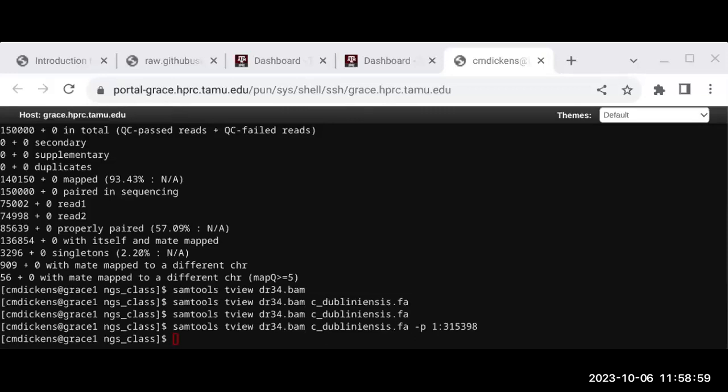If you're going to call this, if you only have a depth of 1, that's not a variant. That can be a sequencing error, right? So you have to have a minimum depth to actually call it a variant. Usually it's about a depth of 10. You can change that to be more lenient, 5, or make it more stringent, 20. But usually the software has a default value. But definitely a depth of 1 is not good to make calls on.